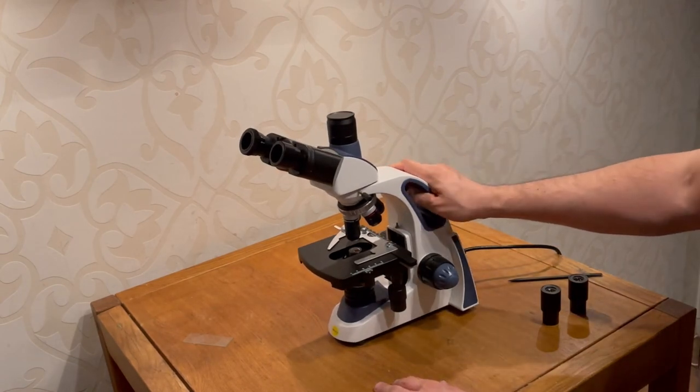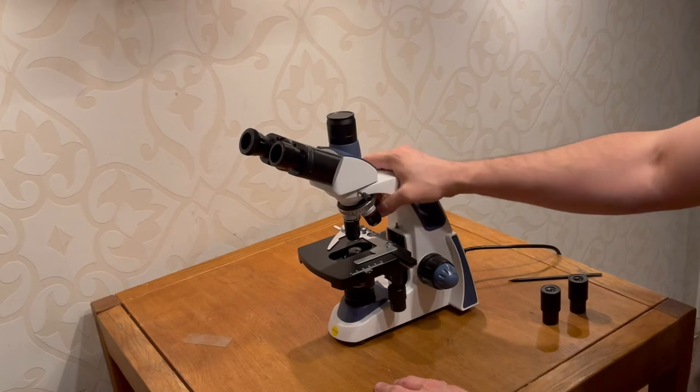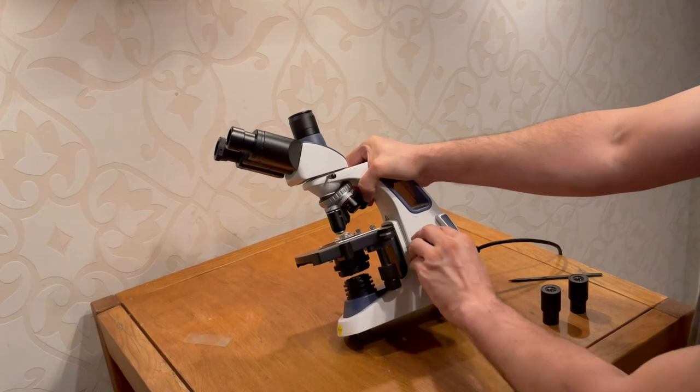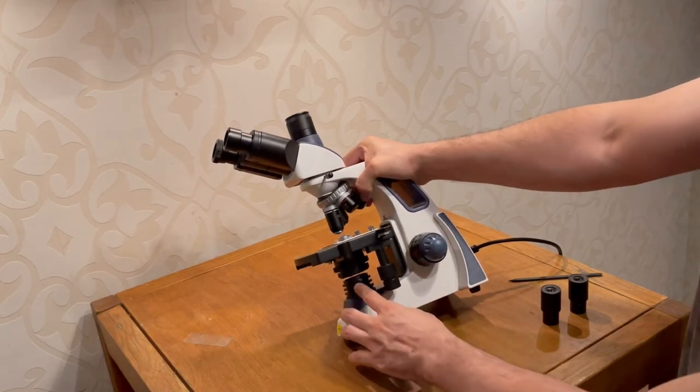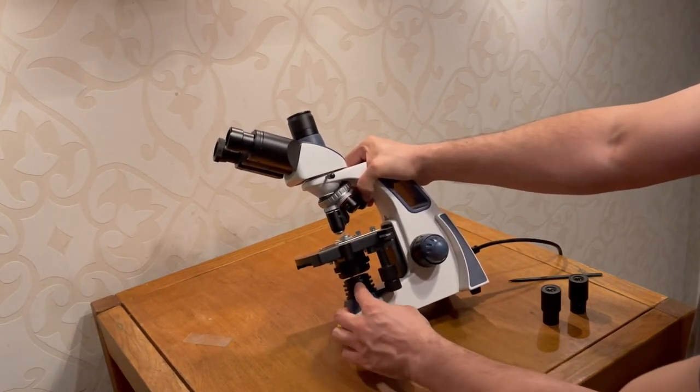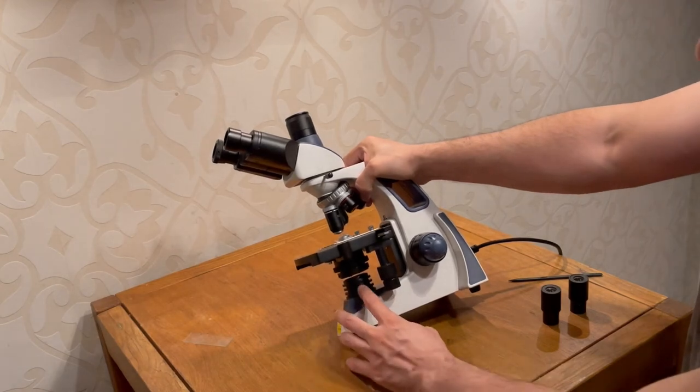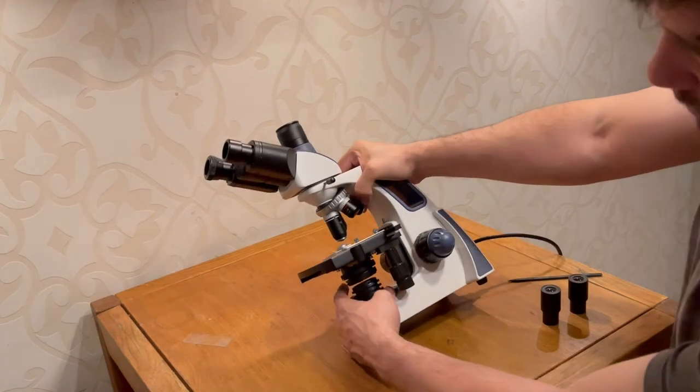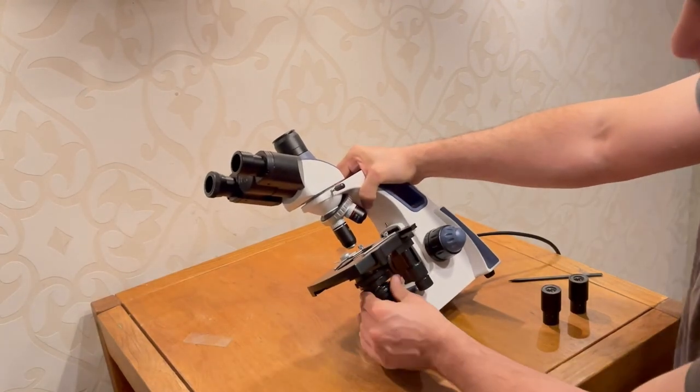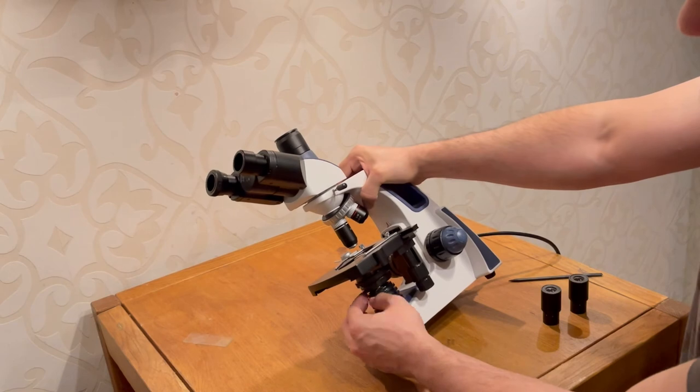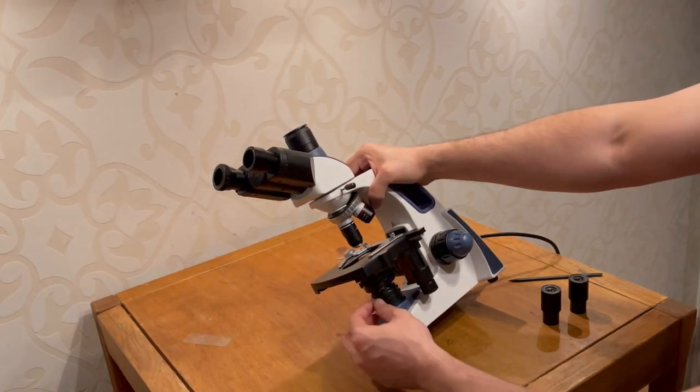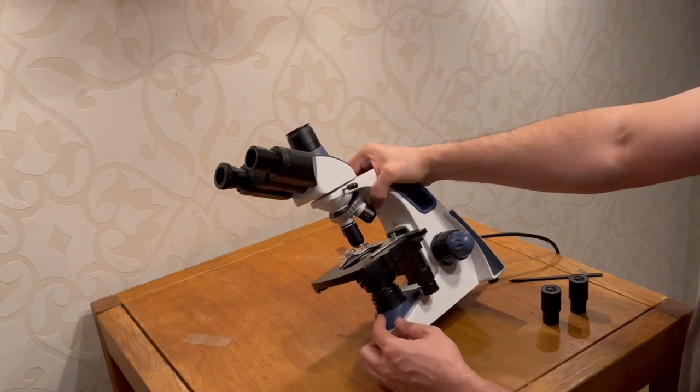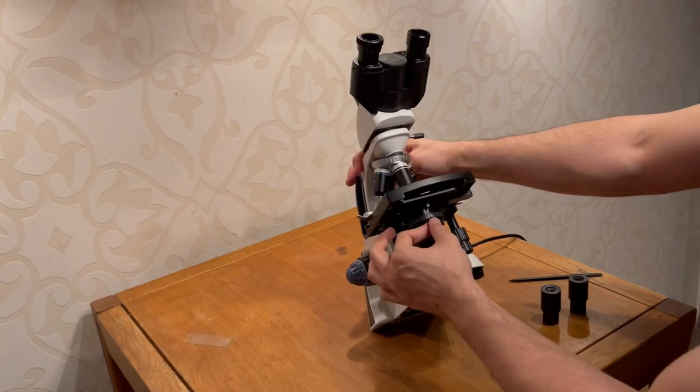On the other hand, maybe one more thing to notice. If it's in the lower position, the table, then the distance between the diode, or the focusing lens of the diode, and this part of the table is quite low. So, it's very hard to, for example, change the filter. It's impossible to do that. So, it would be good if they would put some sort of a thing stepping out on the side. The same thing as they did with the diaphragm.